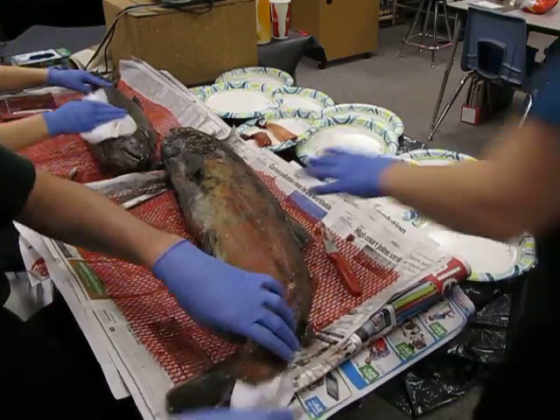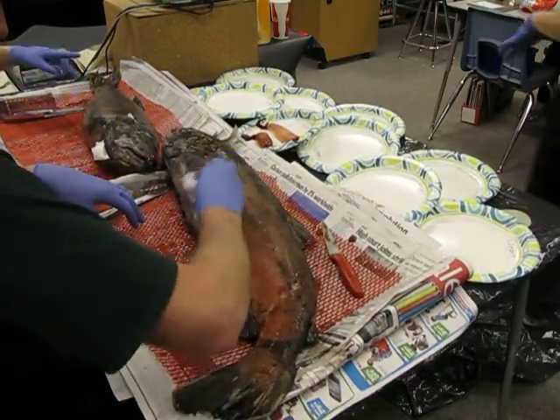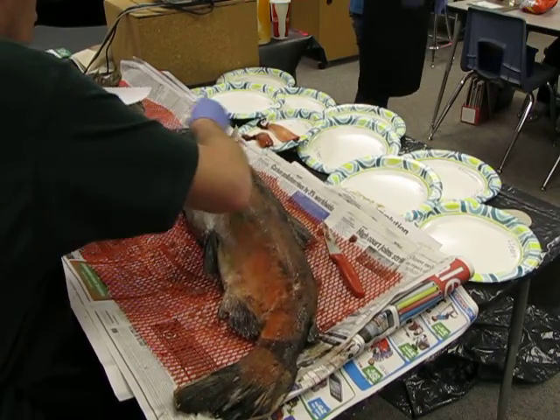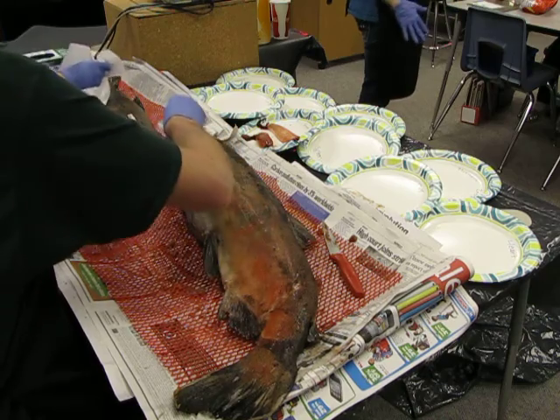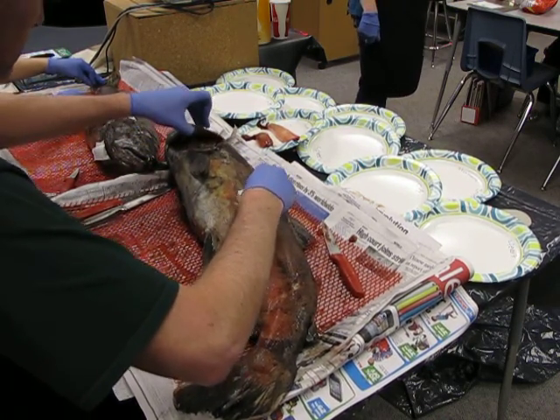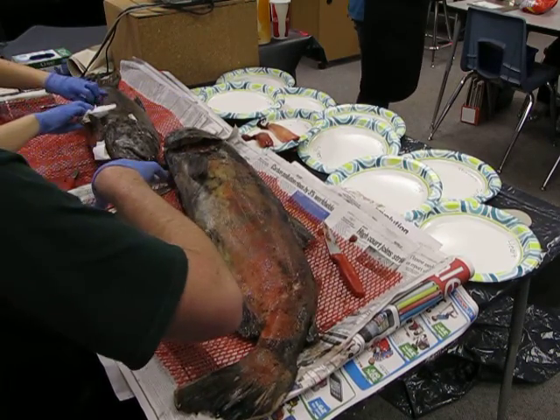What they're doing is drying off these guys, partly because they've been frozen for a long time, so they're a little bit wet. But there's another reason too. These salmon, their bodies are covered with something that's kind of slimy. Well, they do have scales, but on top of their scales, their body makes it all the time.